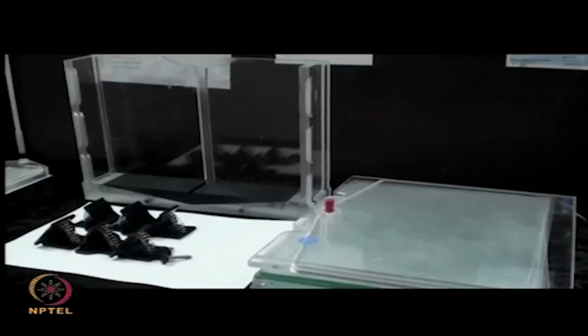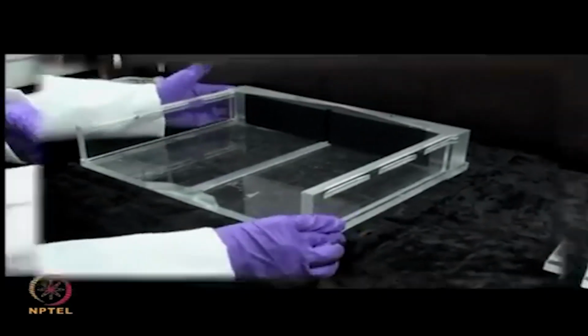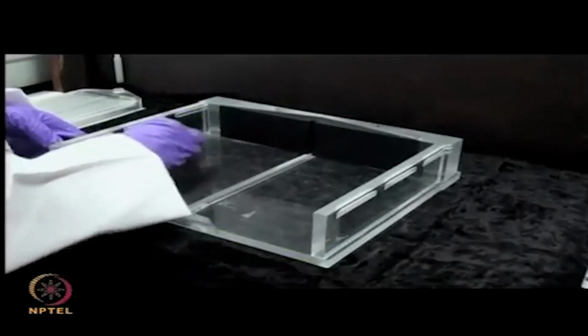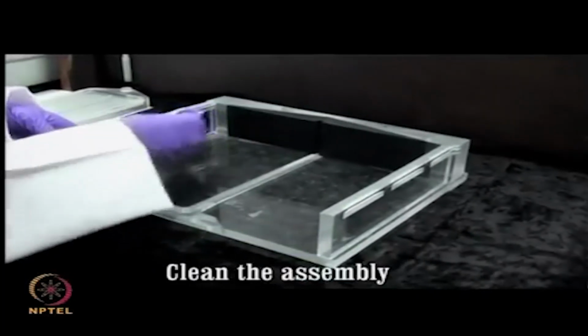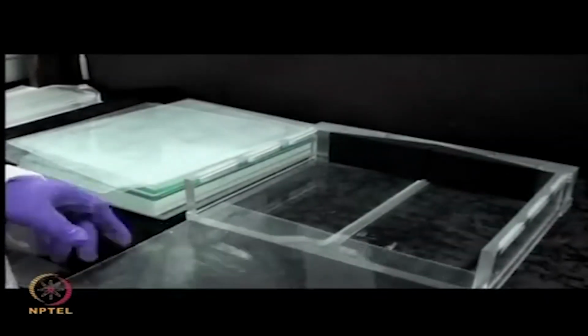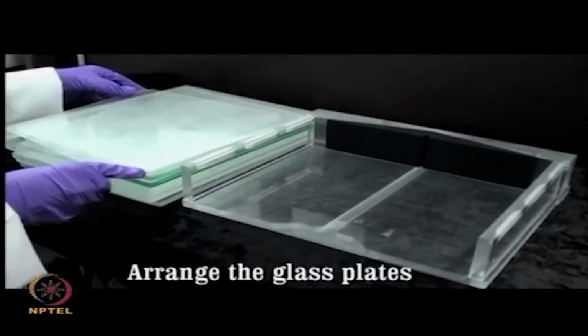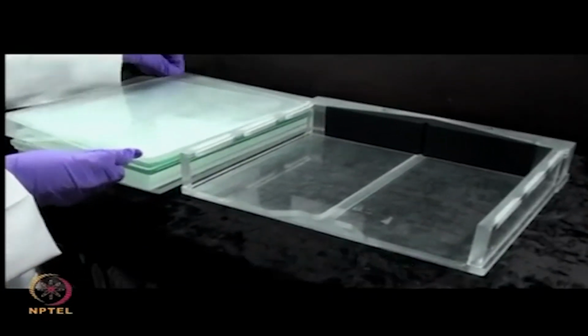Clean all the components of the gel assembly thoroughly with water and dry them with paper towels. Carefully arrange the glass plates in the gel casting assembly, interspersed with separator sheets depending on the number of gels to be run.